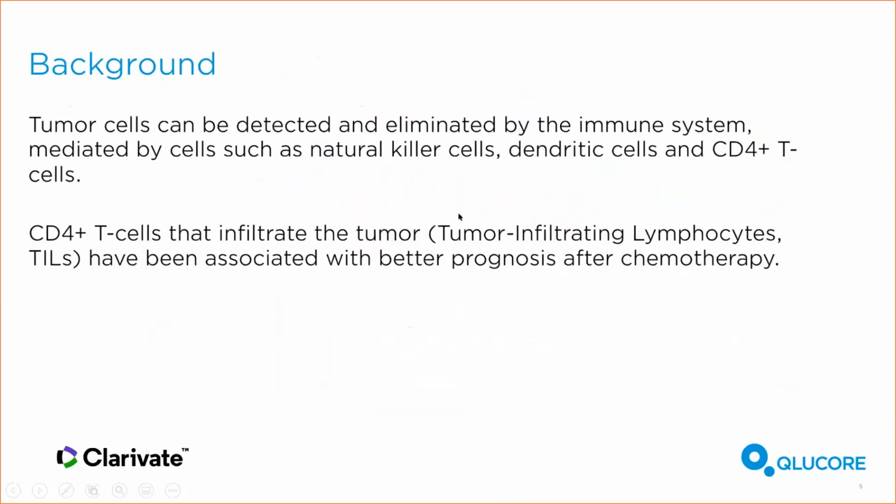Okay, so in the next slide, we've introduced now the two tools that we've used, the Omics Explorer and MetaCore, and now the introduction to the topic. So this is about tumor cell infiltration by lymphocytes. So the immune system cells do infiltrate into tumors, and that's part of the process to detect and eliminate and clear the cancers as they start to establish themselves.